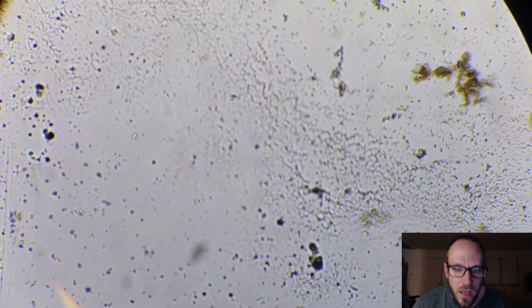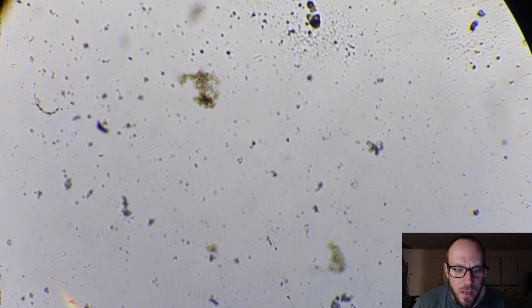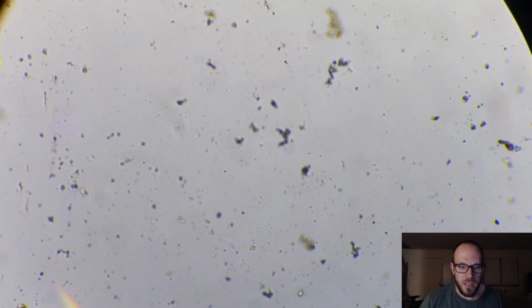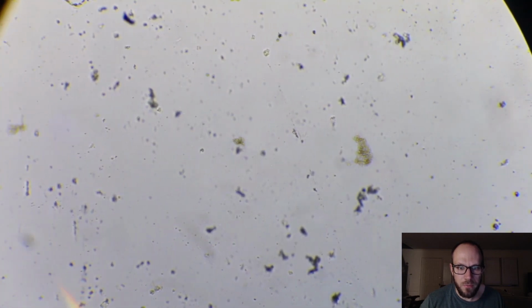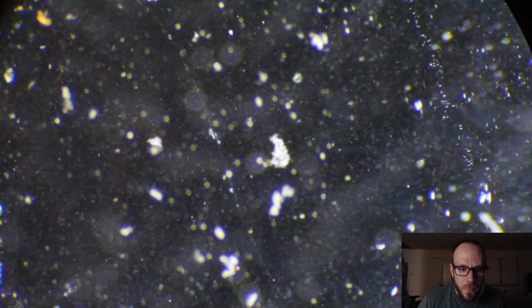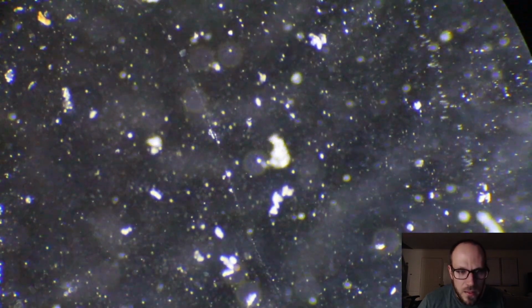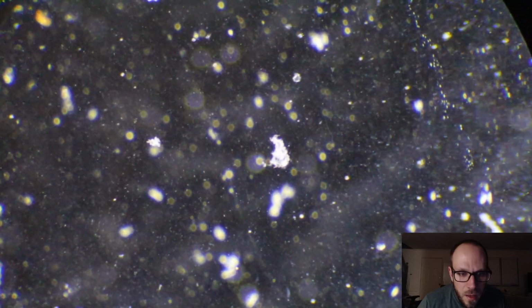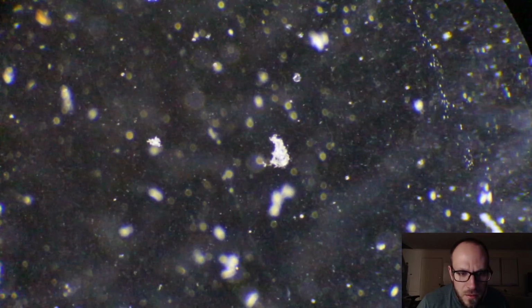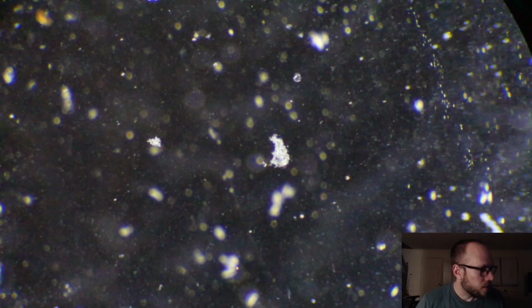Nothing that interesting. But, I mean, in my limited experience, samples taken from the top of the water haven't been too interesting. I am curious as to what this might be. It looks like some manner of... What's a clump of crap? That's what that is. Just decrease the light a bit. Let's try and zoom in on it.